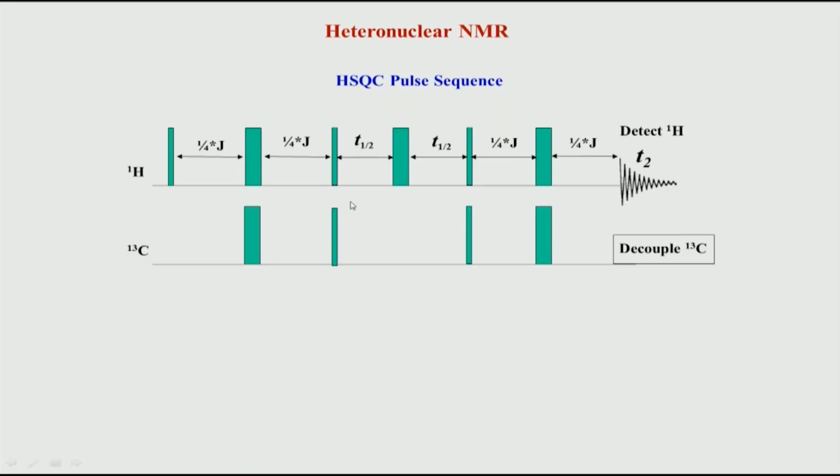This is what the pulse program will look like. So, this is a pulse sequence. What does pulse sequence mean? If you recall, a pulse sequence is the sequence of pulses which are applied in an experiment.